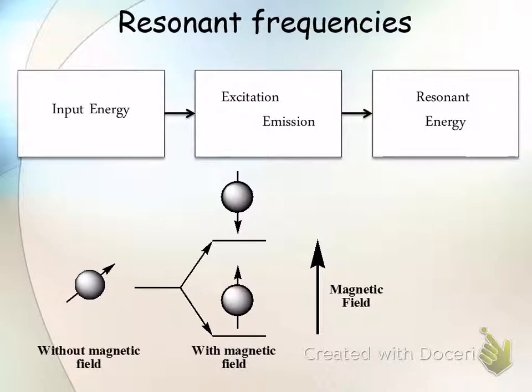And what was FID? Free induction decay. It's basically that picture that I showed you, the squiggles going down, without the first part of the noise. So we have two spin states, is what we call them, for protons or magnetic moments in a magnetic field. The protons, hydrogen atoms, have a magnetic moment. We stick them inside a magnetic field, and it's either going to line up with the magnetic field, like a compass would, or it'll oppose the magnetic field, and this is the high energy state.